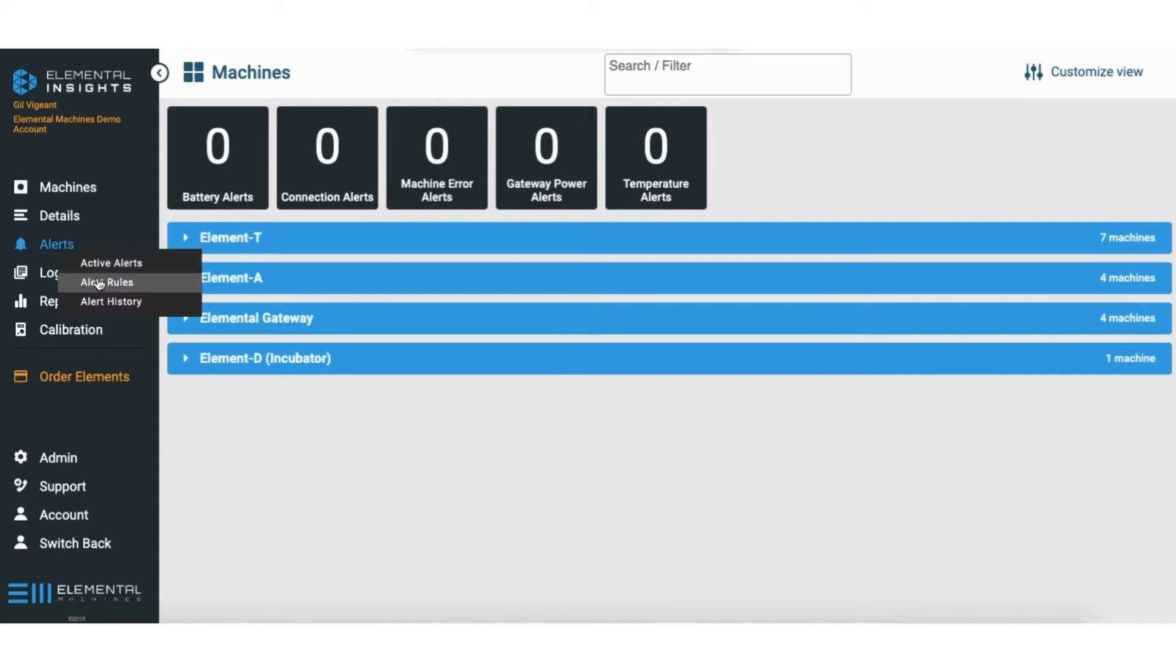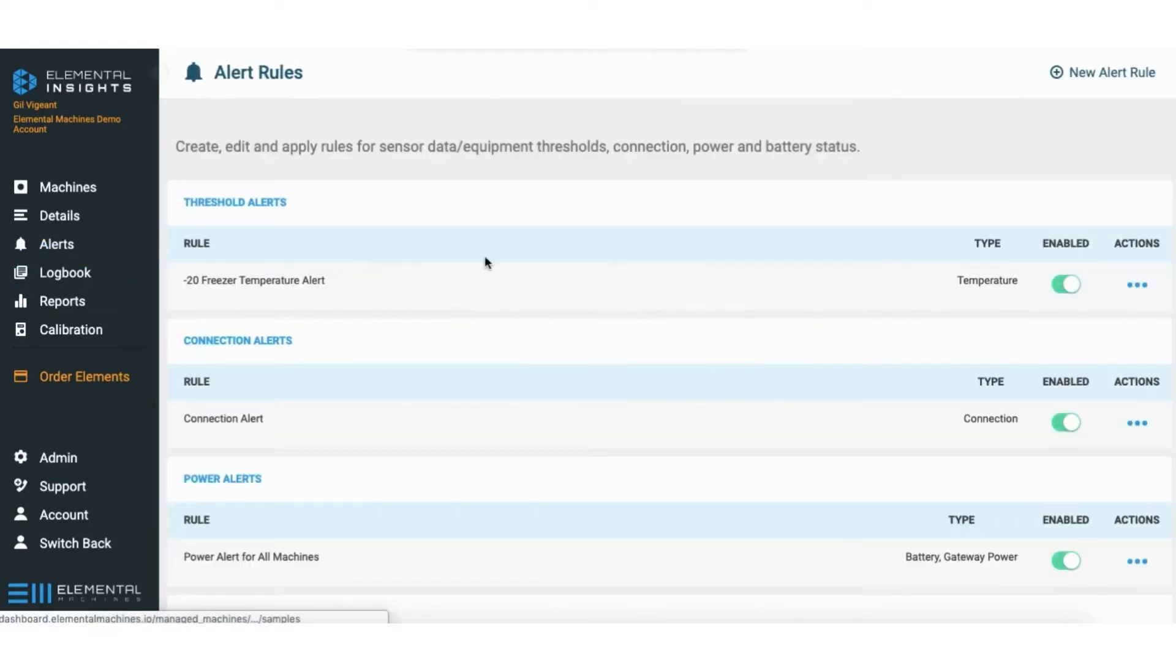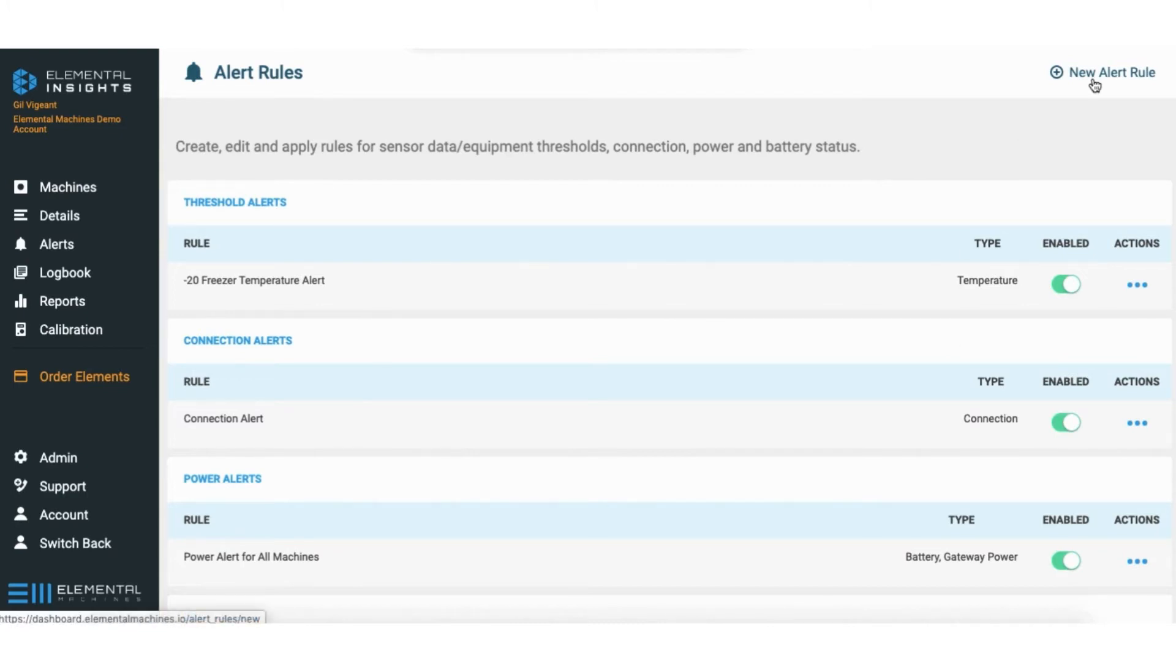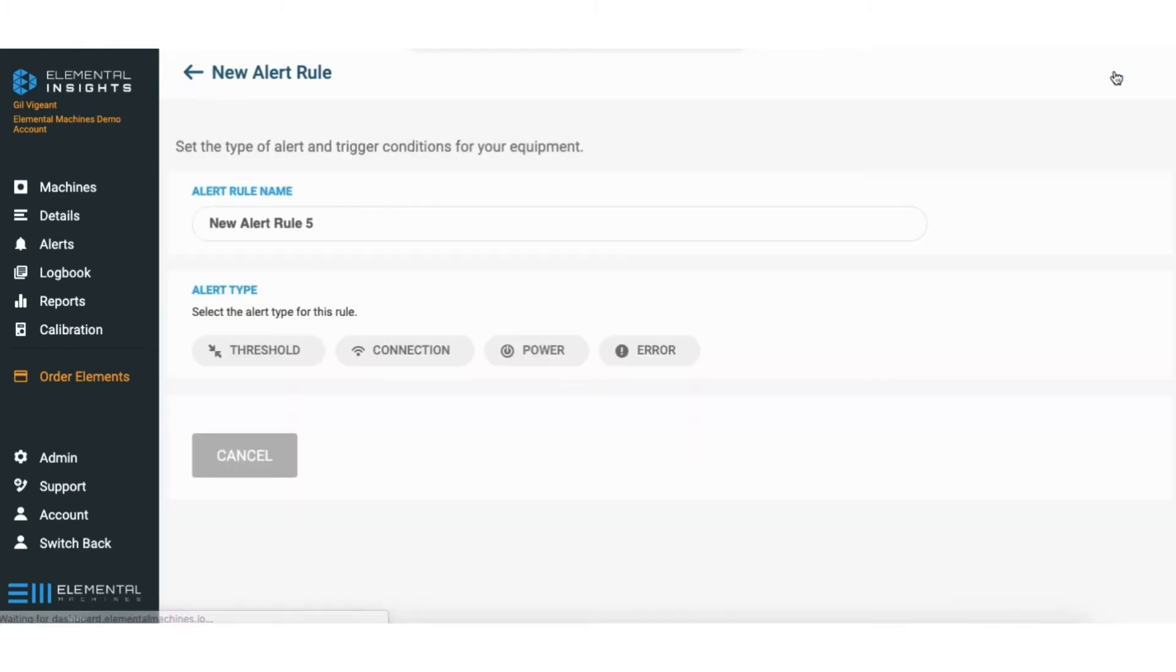From here we'll see what we currently have set up, but I want to create a rule for my minus 80, so I'm going to click on the top right on new alert rule.